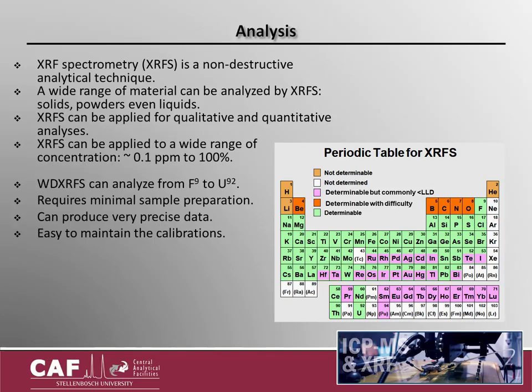XRF spectrometry is a non-destructive analytical technique. A wide range of material can be analyzed, such as solids, powders, and even liquids. The XRF spectrometer can be applied for qualitative and quantitative analysis. It can also be applied to a wide range of concentrations, from 0.1 ppm to 100%.